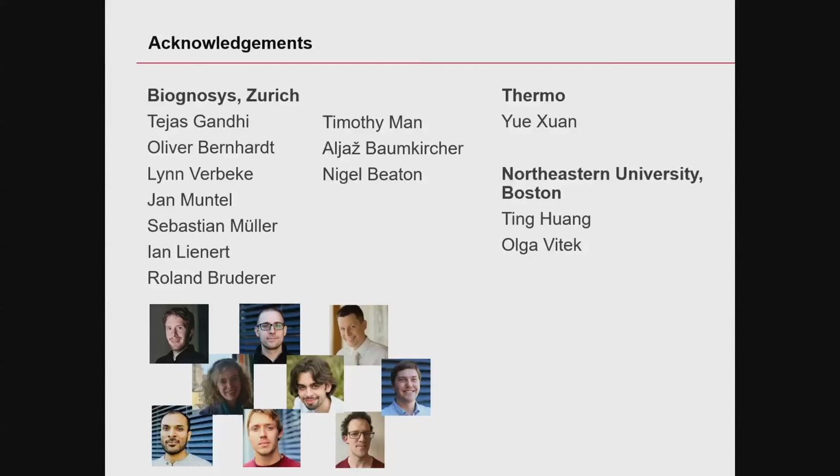But there are certain things you can do to improve the analysis with PTMs. In every DIA software, I guess it's the same. What you can do is, for instance, when you do phosphoproteomics, which we have also done in the past, you can include more of the fragment ions into your library being used. So in Spectronaut there's a setting to do that. In other software, I guess there is the same thing: how stringently you filter how many of the fragment ions should be used in the analysis afterwards.